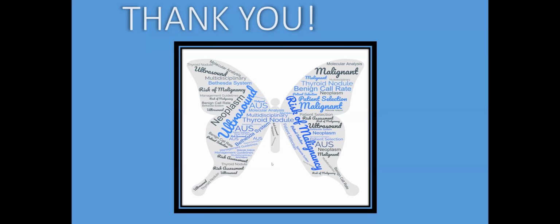Our thyroid FNA samples, the second question, come in very bloody, quite unlike the clean slice we project. What is your recommendation on sample collection and prevention to prevent this? So the first thing is the needle size. It has to be a 27 gauge needle. I don't even like 25 gauge needles. I will tell the clinicians not to aspirate. So do not pull on the plunger because they can create a negative pressure in the needle, because these are bloody specimens. And do not stay in a thyroid nodule for more than 12 to 15 seconds.